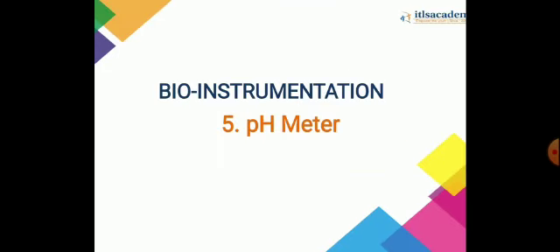Today I'll discuss the pH meter, the fifth instrument under the bioinstrumentation topic. In the previous slides, we have learned about the autoclave sterilization technique, hot air oven, the incubator, the laminar airflow, and now today I'll be taking the topic pH meter.